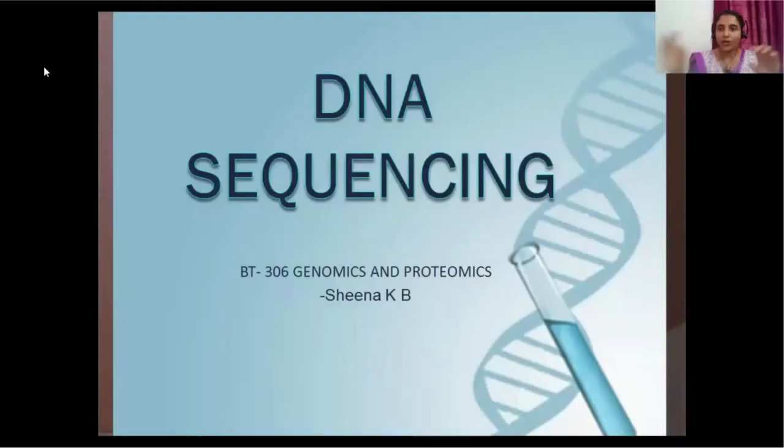And today I have come up with this topic of DNA sequencing. It is one of the backbones or the crux of whatever you're going to learn in the coming days. You take a piece of DNA from the library. You have many pieces of the single genome, right? So this is your single genome. You have many copies of this stored up in the library. You take one piece and then you find out what is the individual base pair present there.